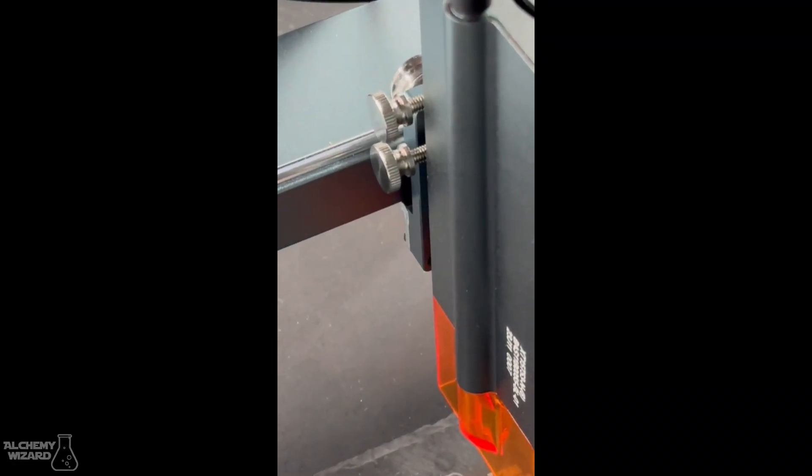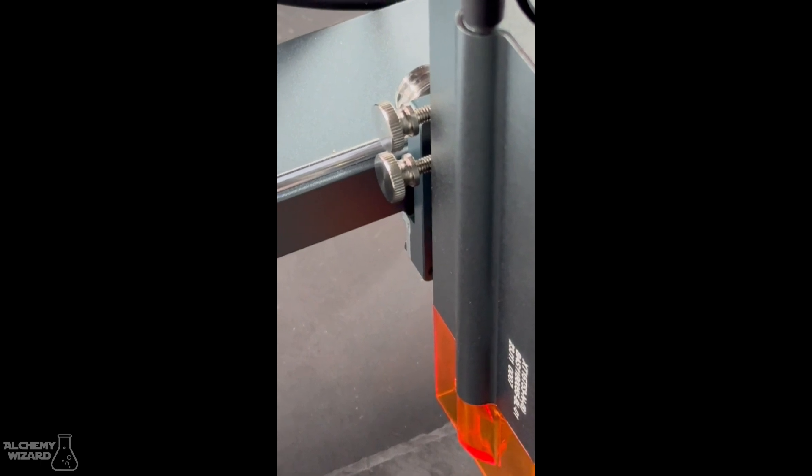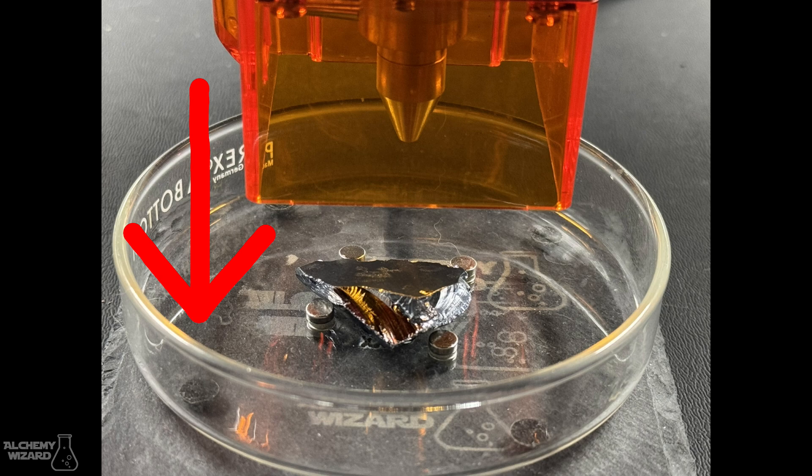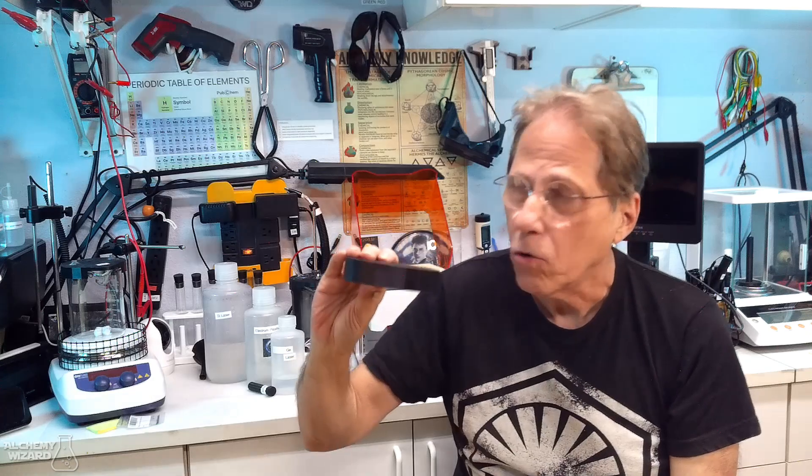If you don't tighten those screws enough, if your petri dish is open and you got liquid in it, it'll just jam into that liquid. That ain't going to be too good for the laser, I don't think, or your sample for that matter. It could screw up the laser.